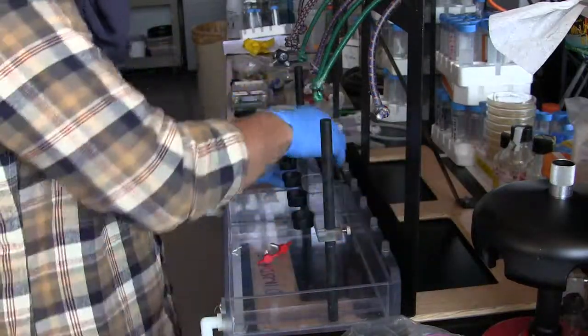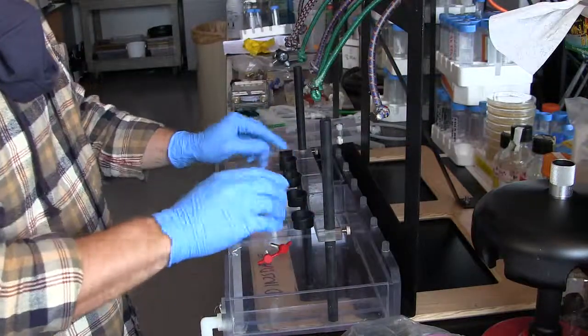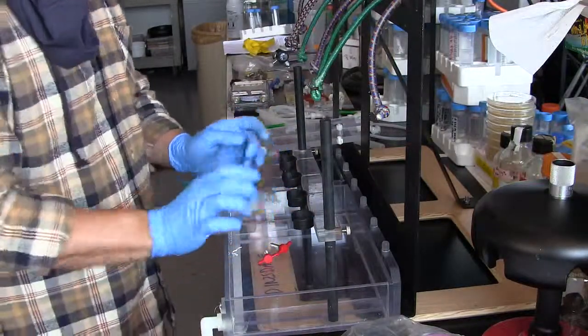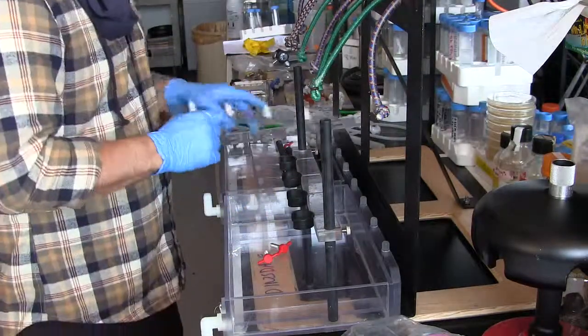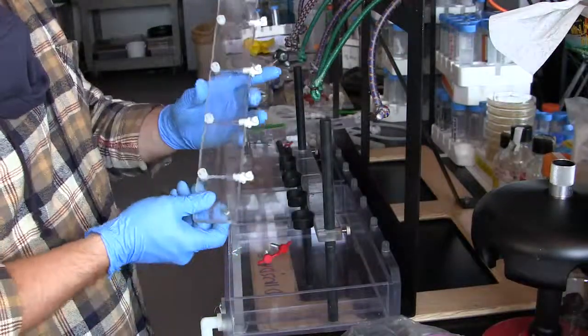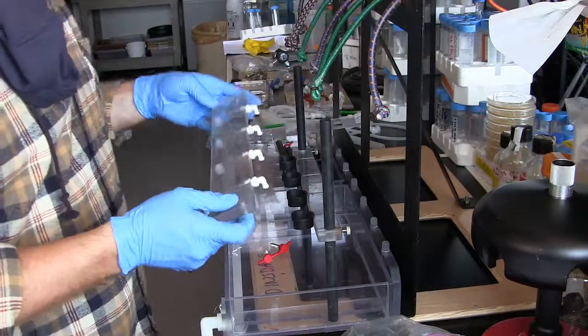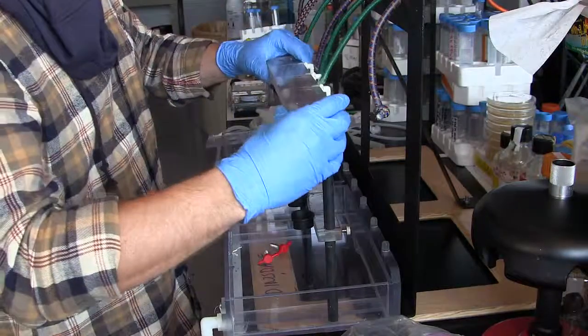Then you tighten the thumb screws here at the back. Now you'll notice that the sample holders are facing me. We can slot bottles and tubes into here, and so we want that accessible at the front. Okay. Then what you do is you take this piece of plastic with the elbows and the luer lock fitting, and you place it so that you have the elbows go to the back and the luer lock fitting go to the front.